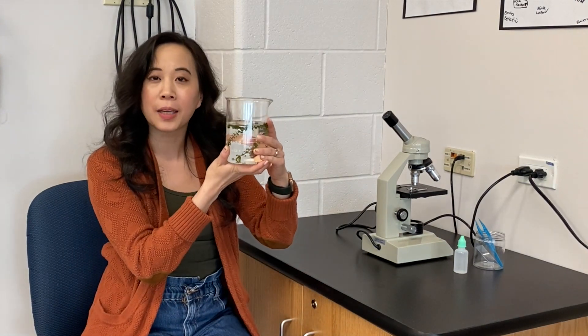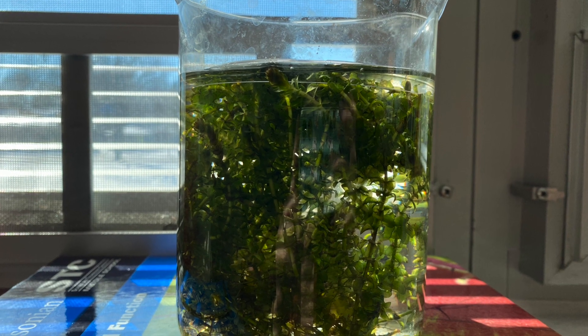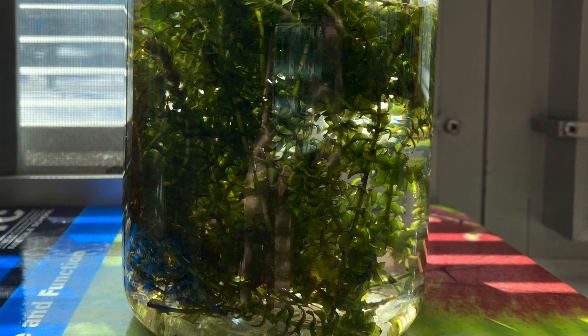Hi, today we're going to show you how to set up a lab to look at chloroplasts using a type of aquatic plant called Elodea. There are several species of Elodea. The type we are going to be working with is called Elodea canadensis, which is native to North America. It's also alternatively called Canadian pondweed.